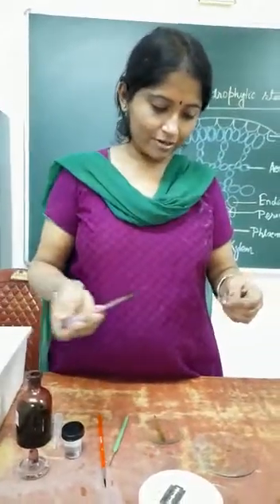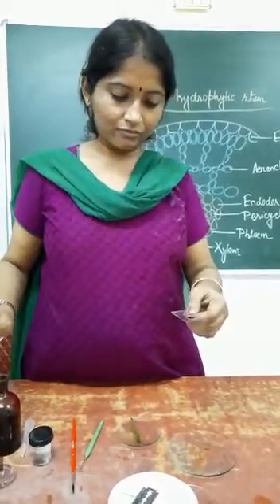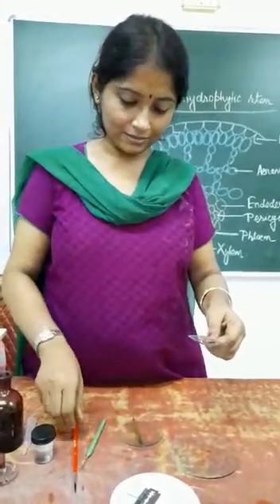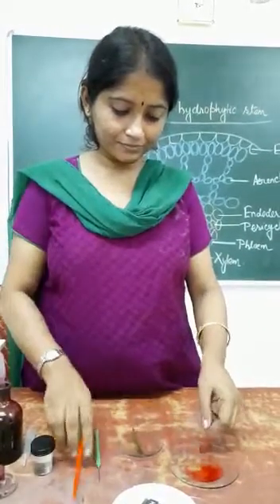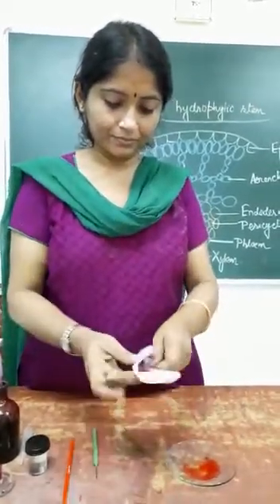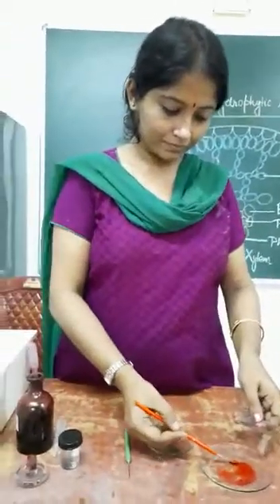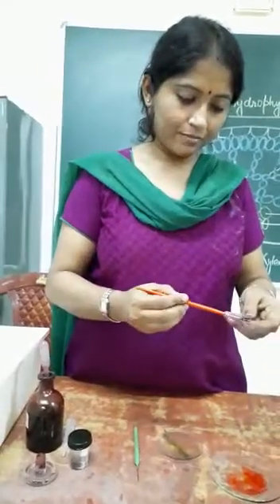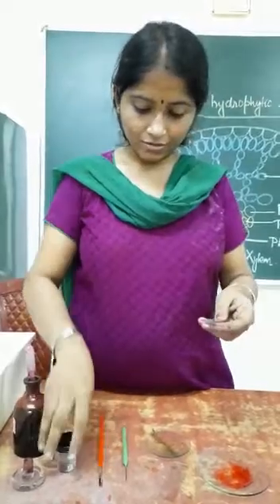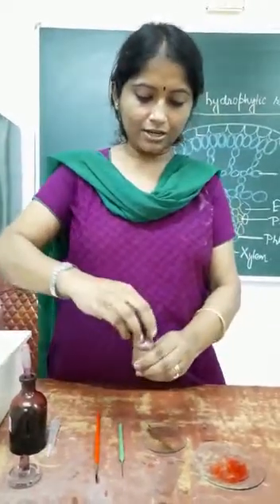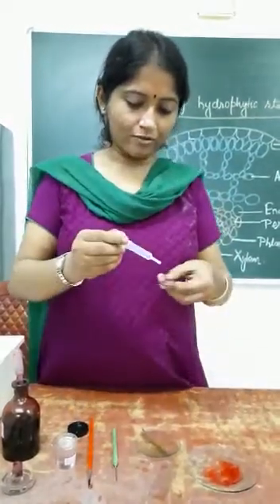I am using the safranin stain. I shall put the safranin stain on the section and leave it for 30 seconds. Then de-stain it and take the stained section on the slide. Use glycerol as a mounting agent and leave a drop of glycerol on the section.